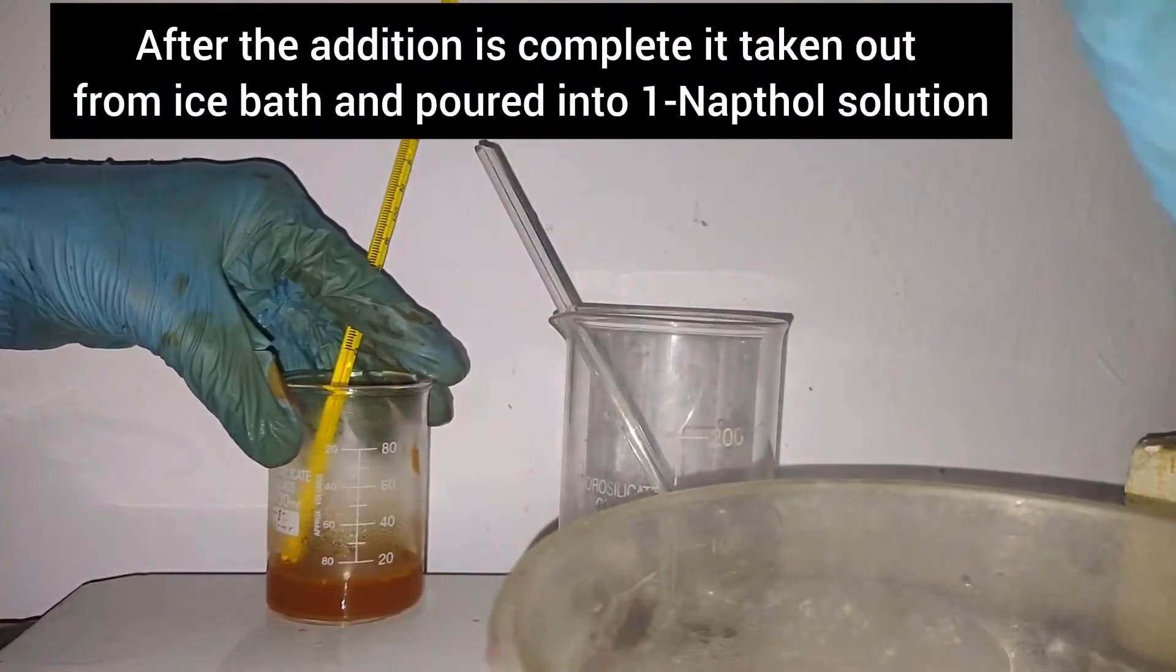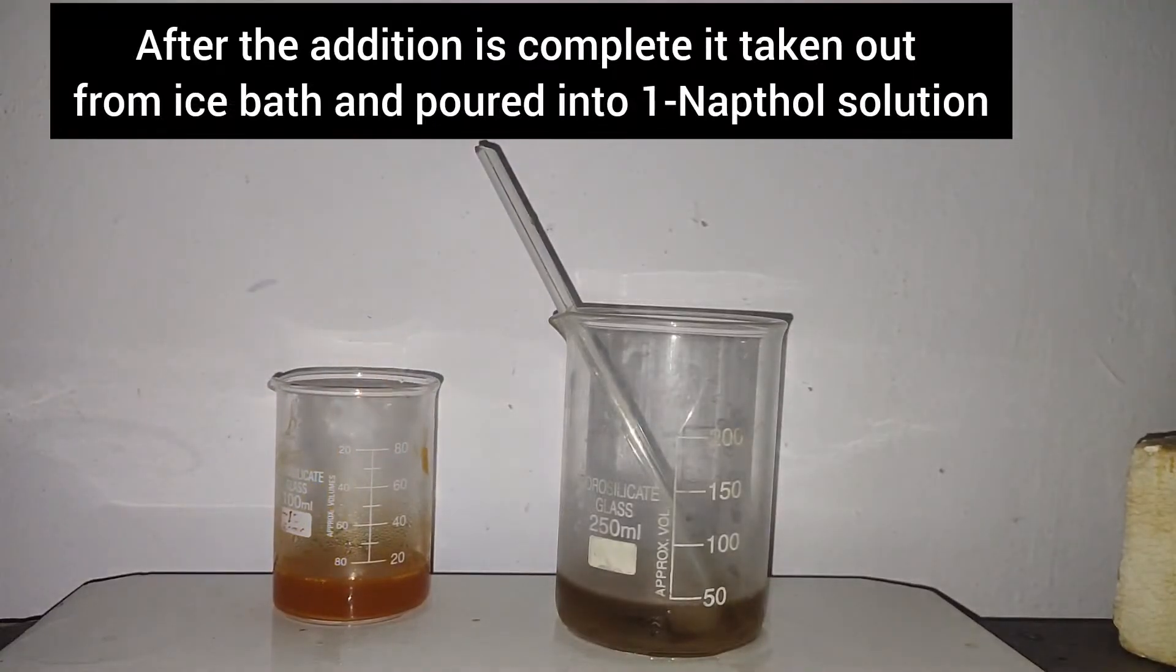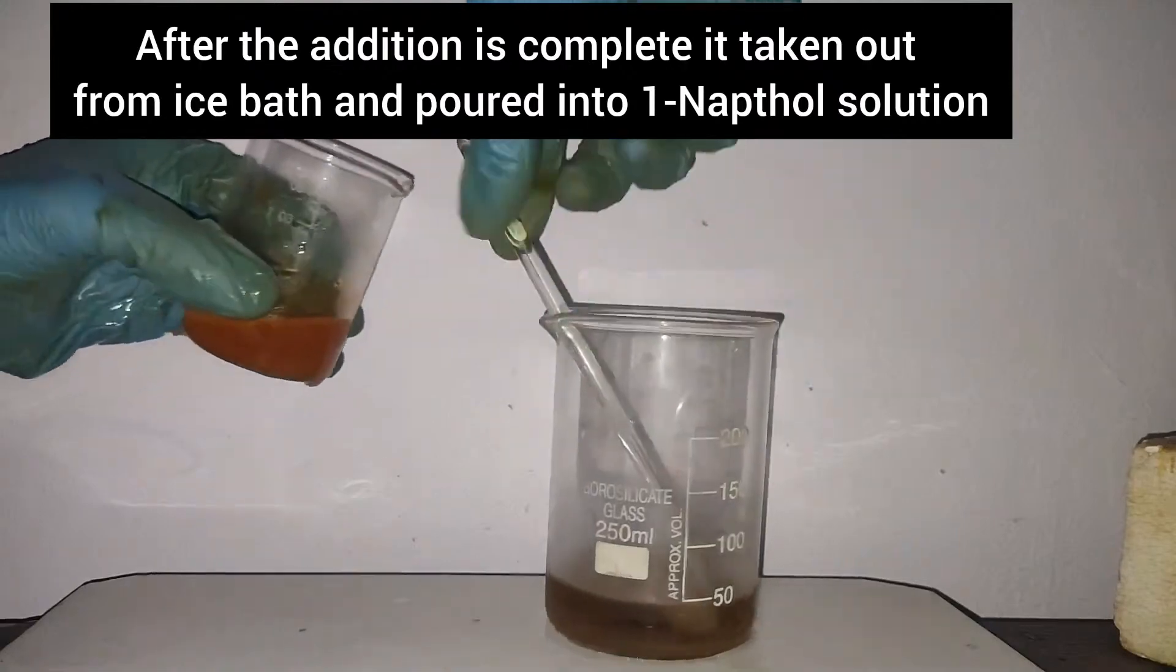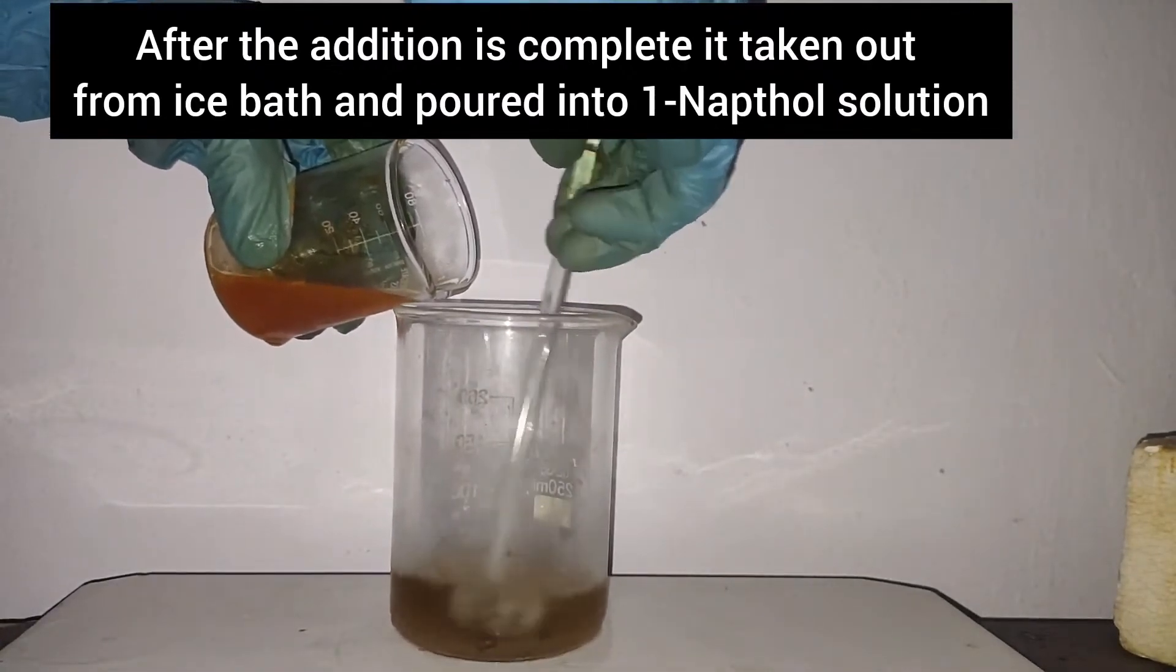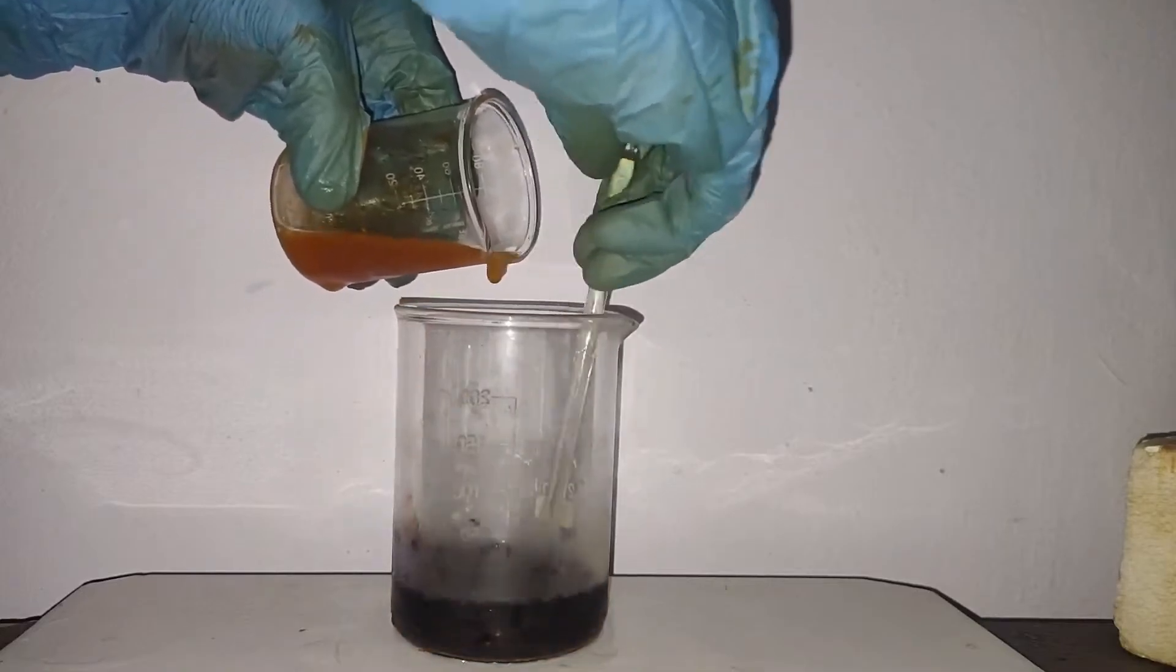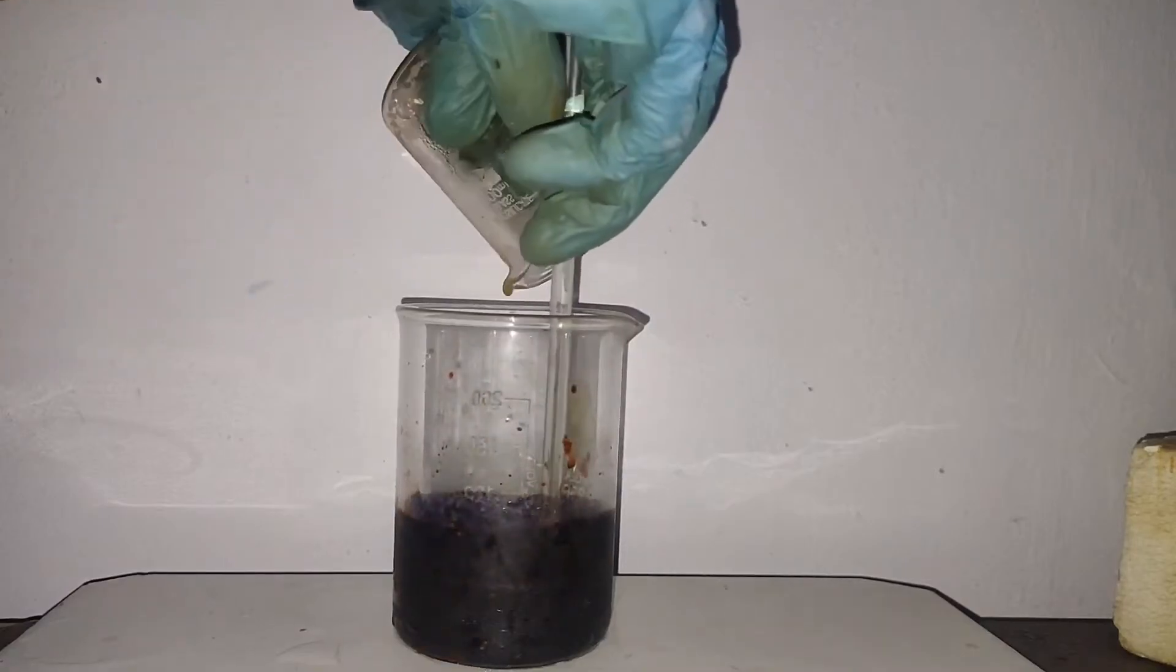When all the addition was complete, the contents were taken out of the ice bath. The diazonium salt solution was poured into the 1-naphthol solution. It reacts with 1-naphthol to form the dye called Magneson 2.